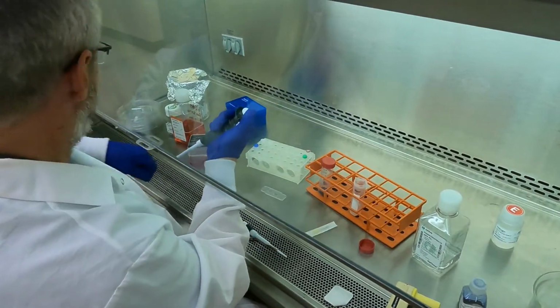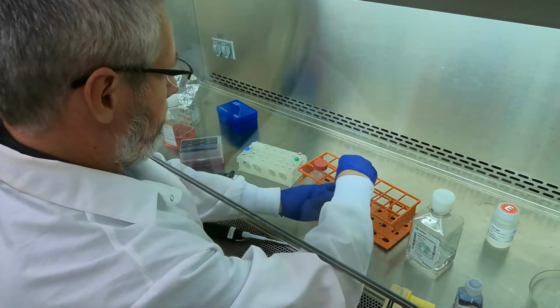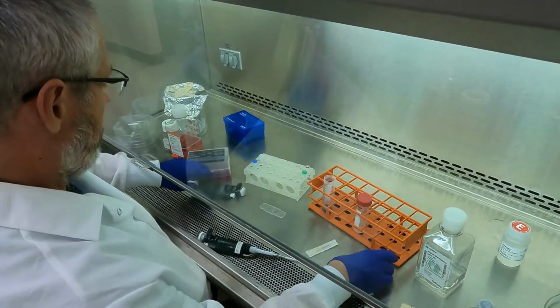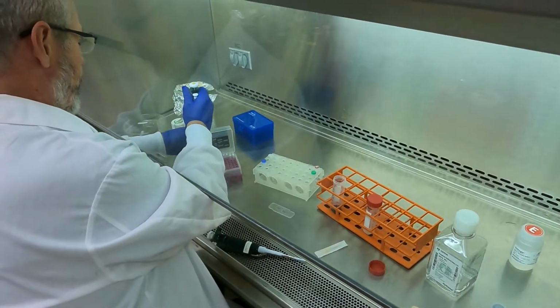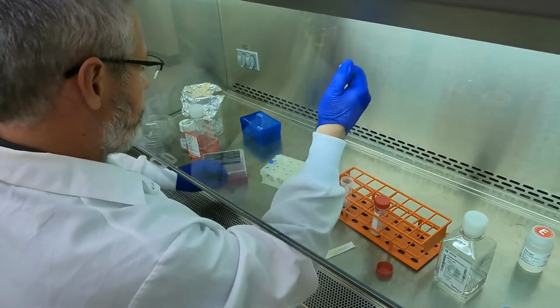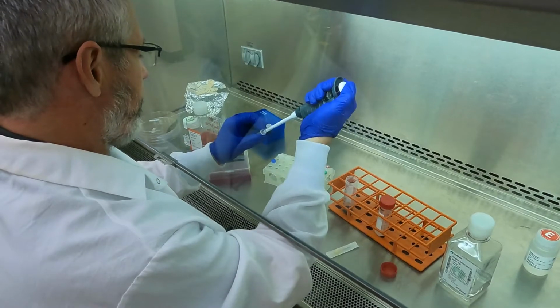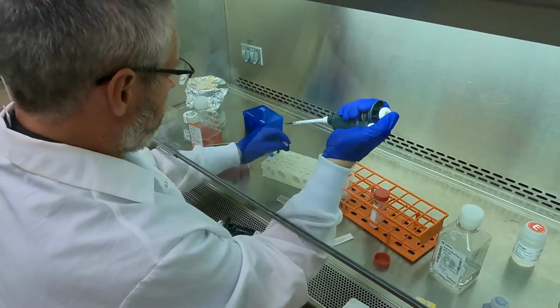That looks like about 1,000,000 a mil to me. I have experience. We'll see in a minute, because we would need to get this rather accurate. Counting them by hand, I found to be completely inaccurate, as Ben Veniste found out to his cost many years ago. You just pipette these up and down.